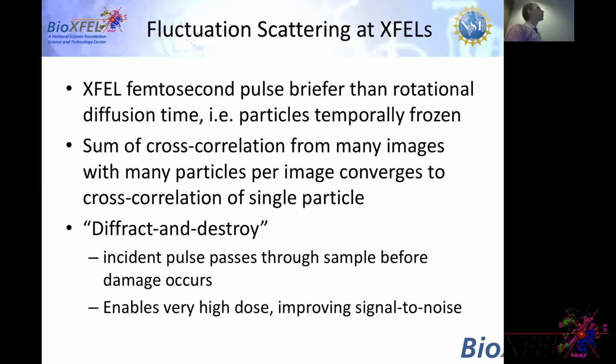It enables extremely high doses, improving signal to noise, compared to synchrotrons, where you have to actually take into account this damage. It allows you to get to much higher levels of radiation.